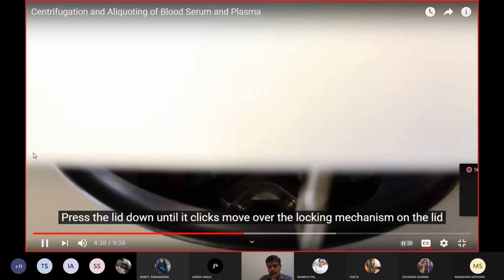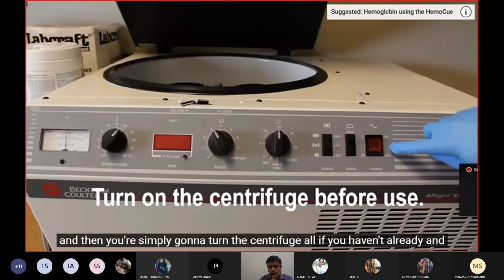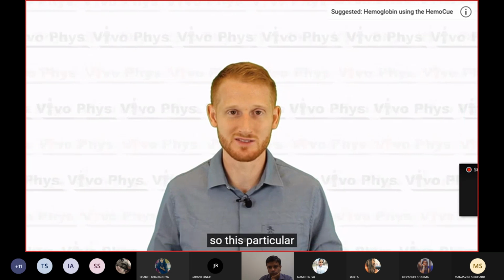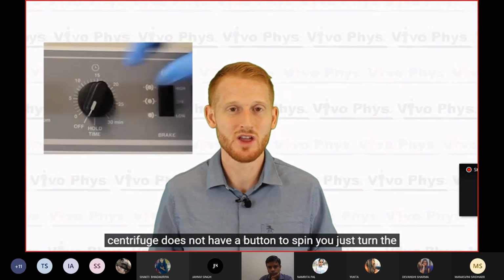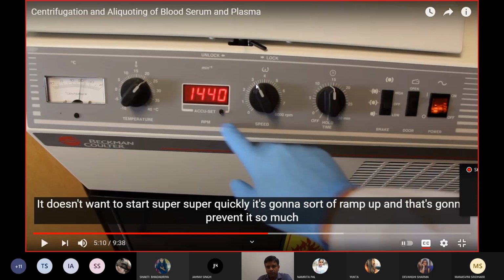Close the lid appropriately, press the lid down until it clicks, move over the locking mechanism on the lid, and then you're simply going to turn the centrifuge on if you haven't already, and hit the button if there is a button to start the spin. So this particular centrifuge does not have a button to spin. You just turn the timer to whatever you want it to be set at, and that's going to initiate the spinning process. So you're going to see a very slow increase in the RPMs of the device, because it doesn't want to start super quick.